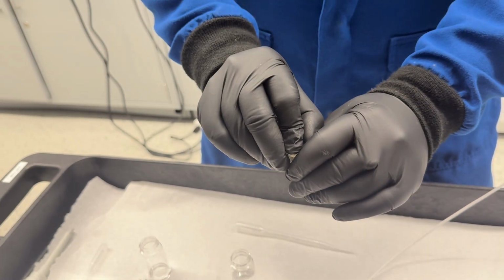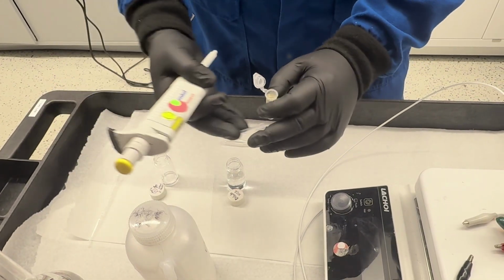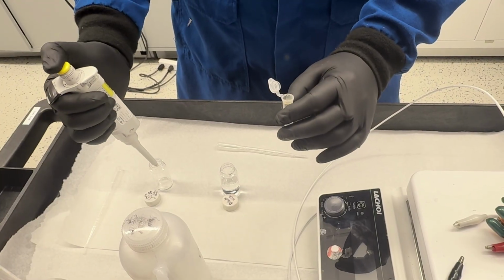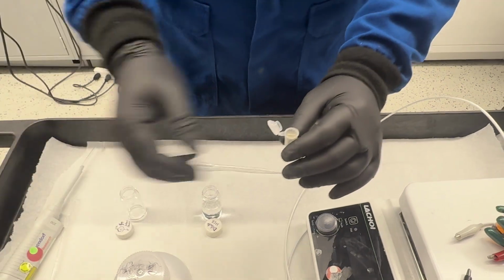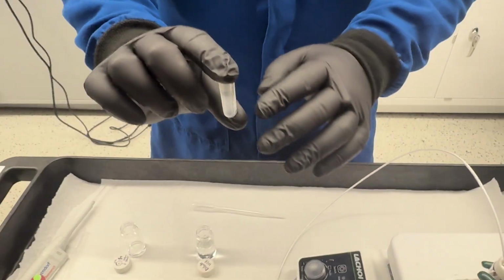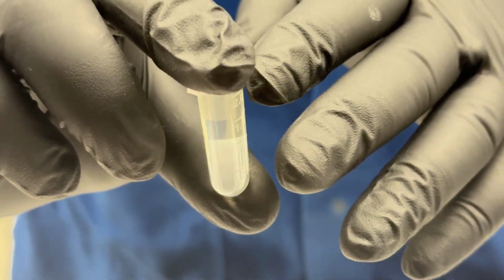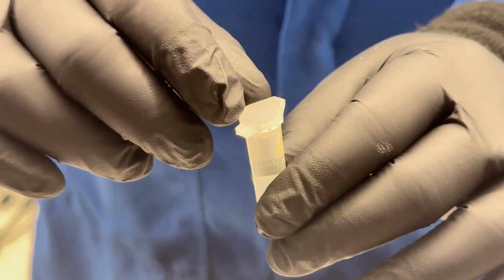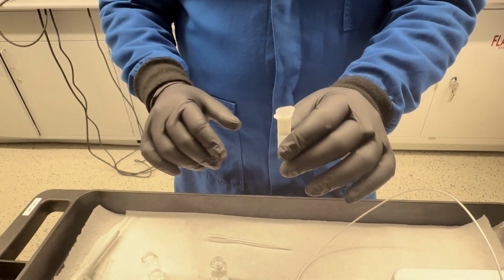Then we add some internal standard for the GC analysis, 20 microliters of it, and we shake up the reaction mixture again. It will again partition between the water part and the organic part, and the organic part should have the product and the starting material. After that, we take some of the organic part and do the GC analysis.